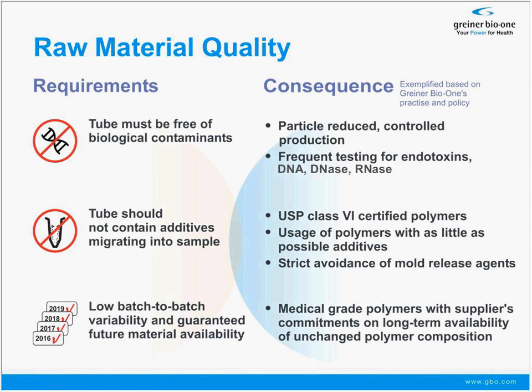First of all, everybody would agree that tubes must be free of biological contaminants for most biobanking applications. The consequence is that from the beginning on, you keep your tube production as clean as possible. What you do is you produce tubes in a particle-reduced controlled environment, and you do this in combination with frequent testing for endotoxins, DNA, DNases, RNases, so all biological contaminants which are known and which should be strictly avoided in this context.